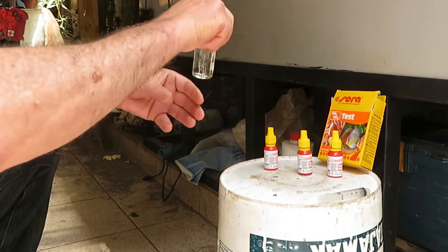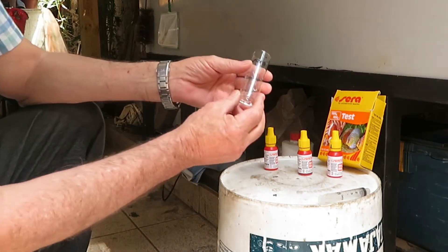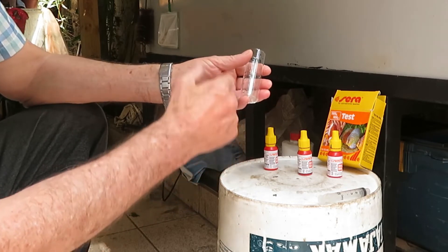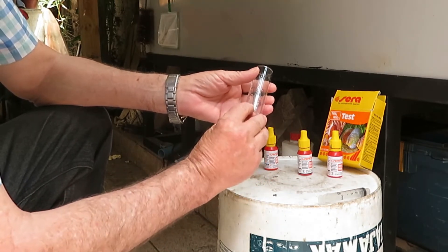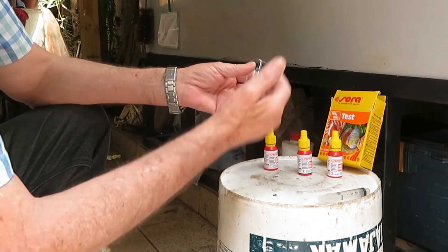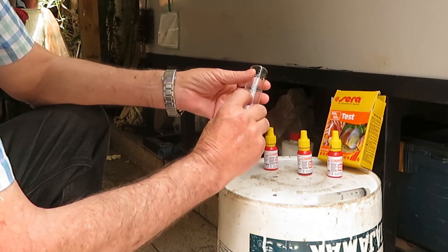Now we're ready to start our test. We have to put 5ml of water in the flask if our aquarium is marine — that is, seawater. If we're testing freshwater, we will need 10ml of aquarium water to do the test.